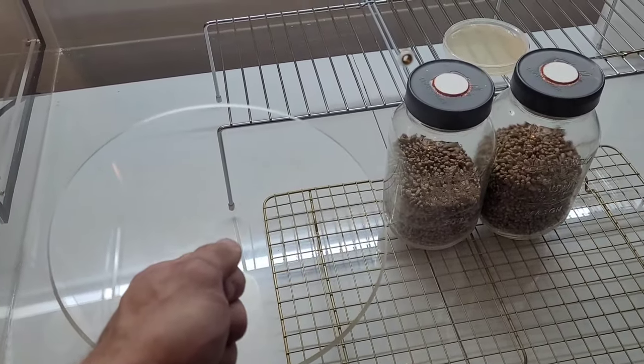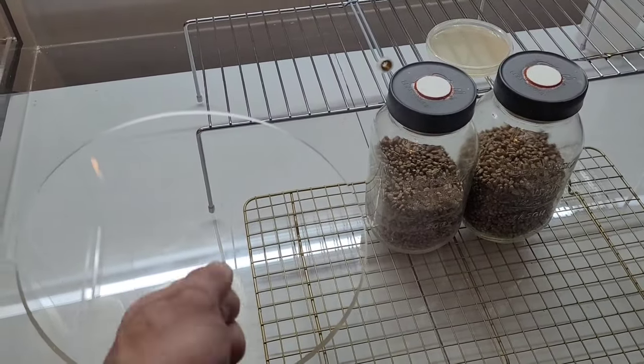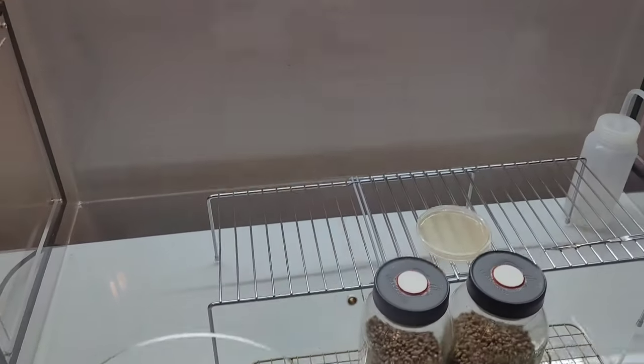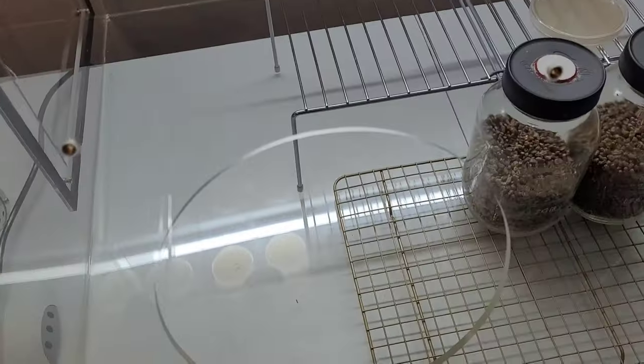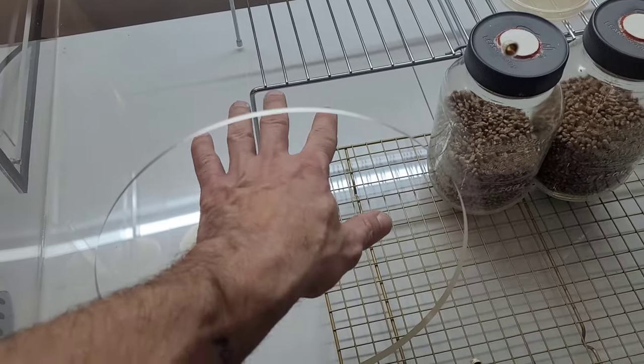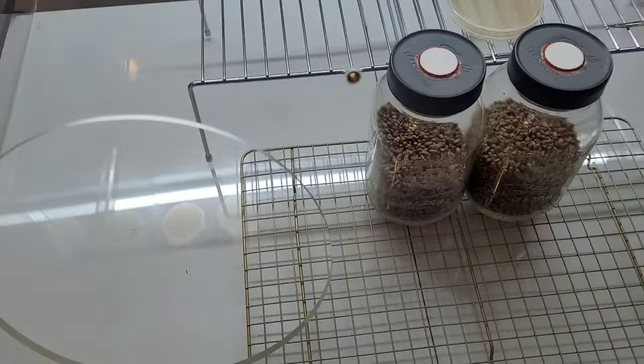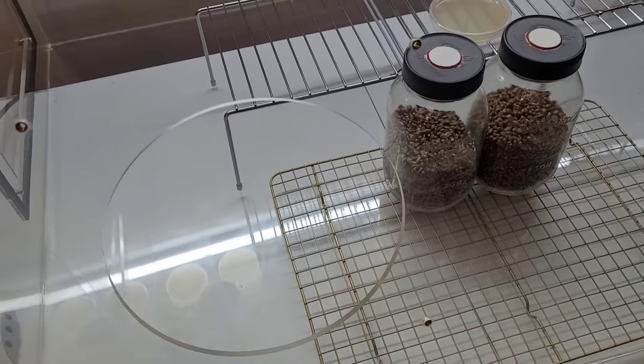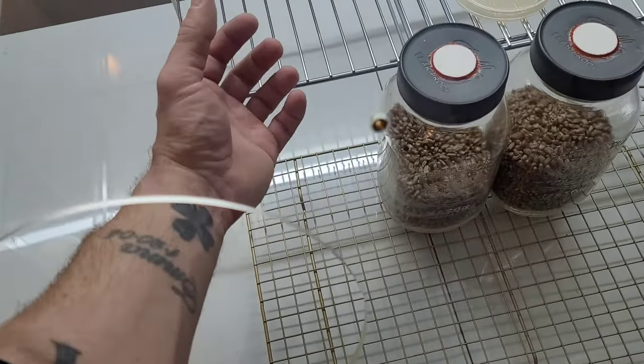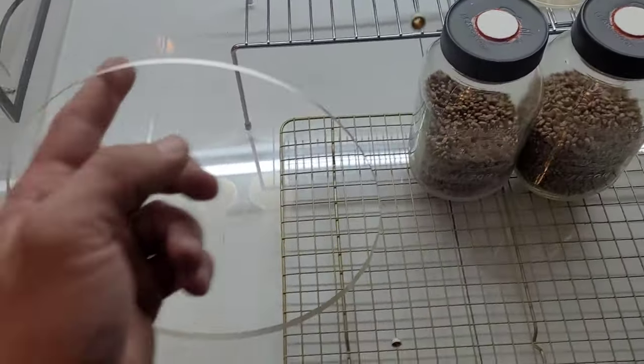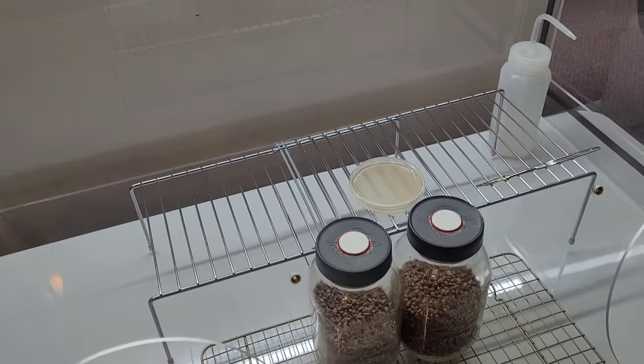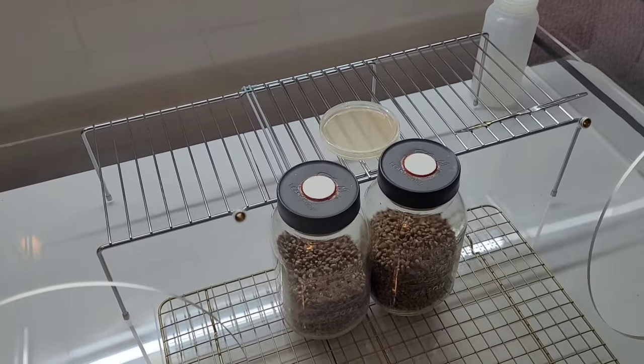Now what would happen as you extend and retract the diaphragm? Well, that's going to create a vortex type disturbance in the internal atmosphere. Now simply imagine that within the diaphragm there are finger holes and enough room to stick your arm in. It's essentially the exact same thing. As your gloved hand, where it is tight, moves around and pumps the diaphragm that is the arm piece that is attached to your hole, you're creating a vortex-like disturbance within your still air box, rendering it less still.